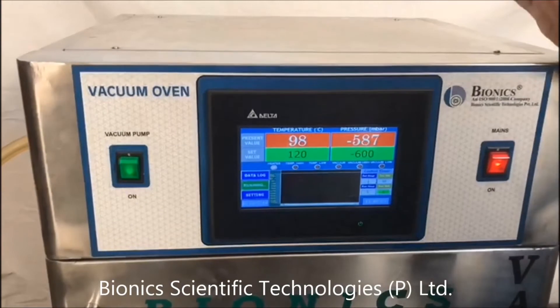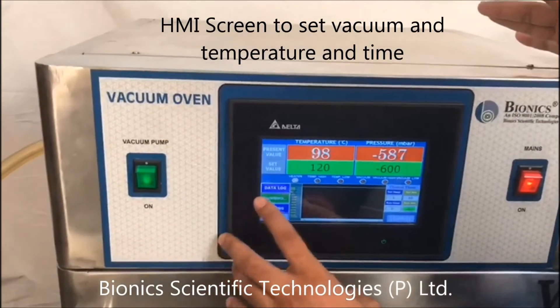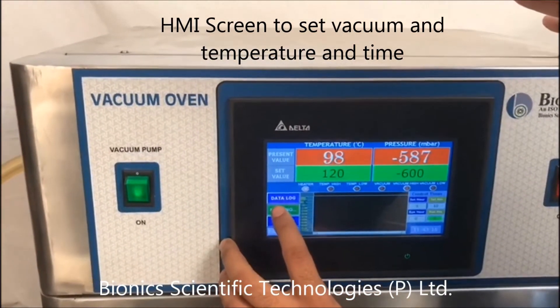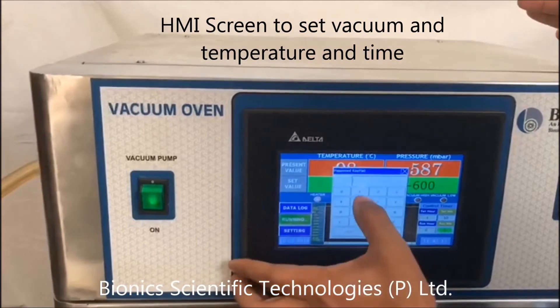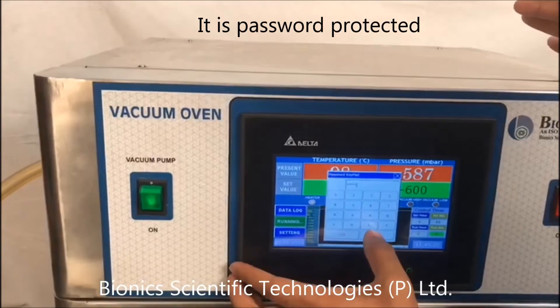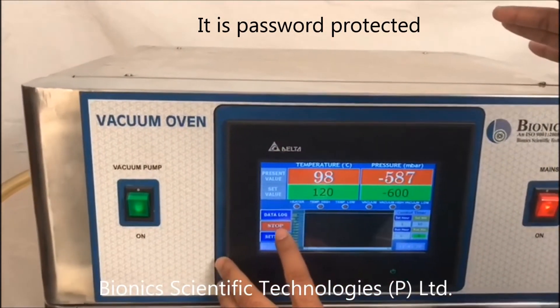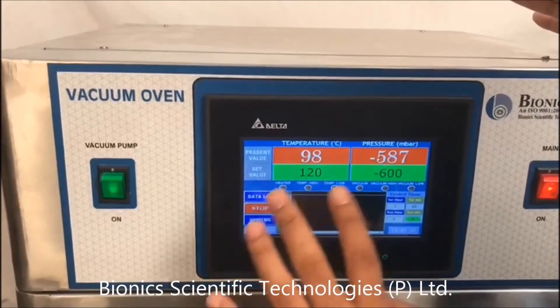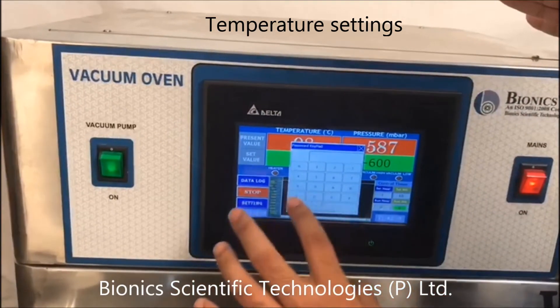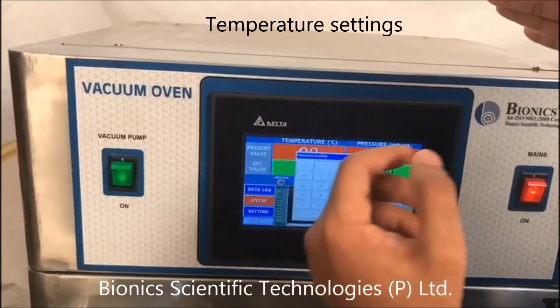Now I'll show you how this machine runs. First of all, it is already running, so what I will do here is implement my settings. First I will enter the password. It is showing here that the machine is not working — it stopped. I enter the temperature which I require, somewhere around 115 degrees Celsius.